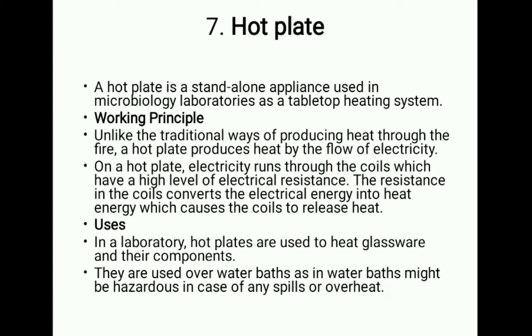Next we have hot plate. A hot plate is a stand-alone appliance used in the microbiology laboratory as a tabletop heating system. Talking about the working principle, unlike the traditional way of producing heat through fire, a hot plate produces heat by the flow of electricity.